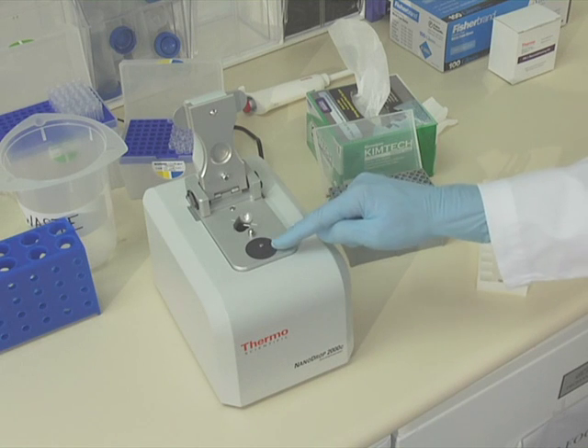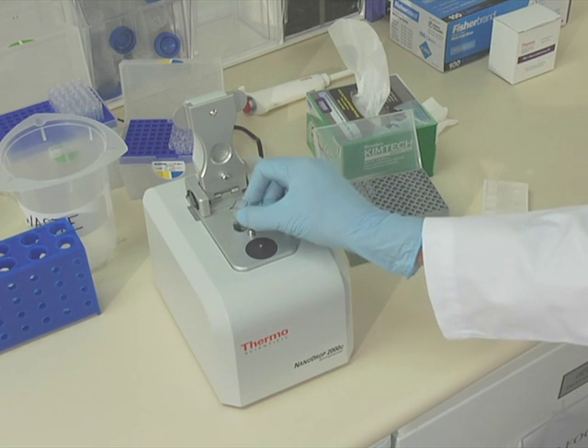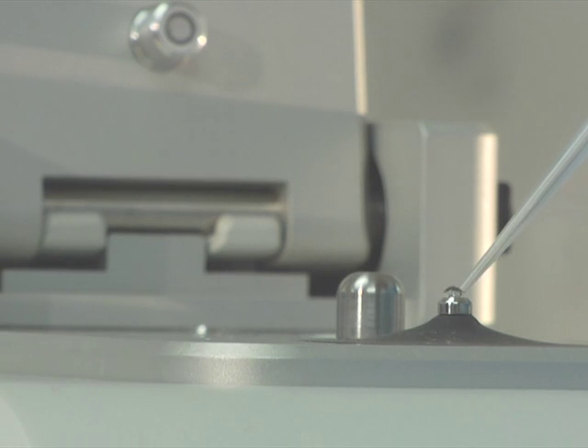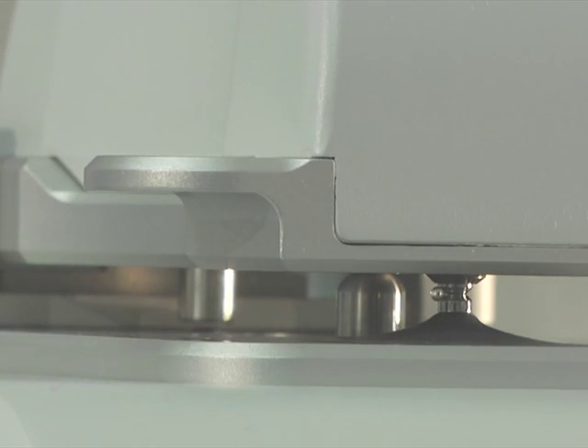In cases in which a cuvette is warranted, such as kinetic studies, the NanoDrop 2000C provides a cuvette option in the same spectrophotometer. For this protocol, we will use the microvolume pedestal option to determine protein concentration.